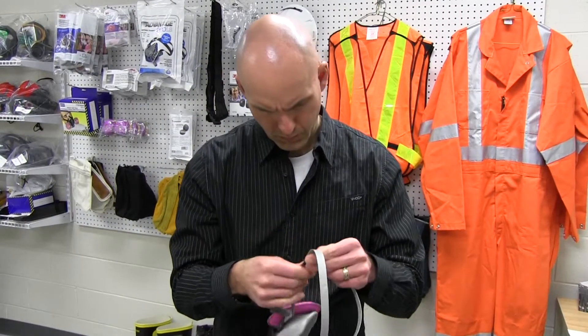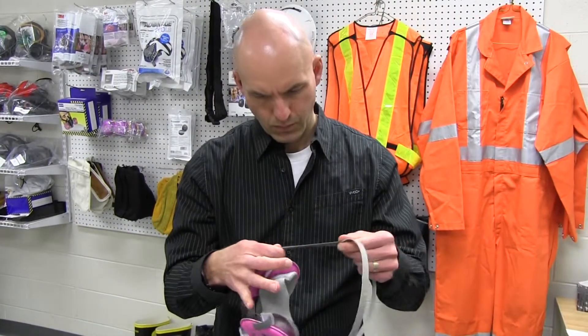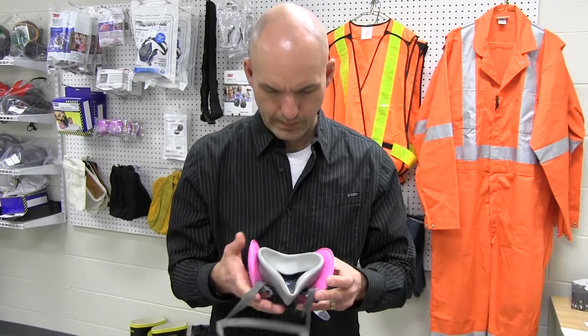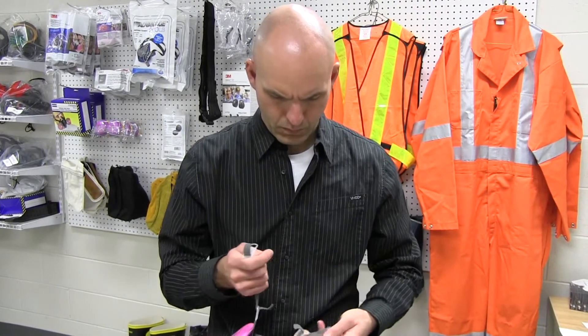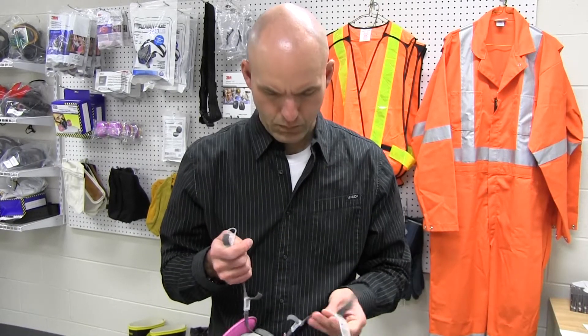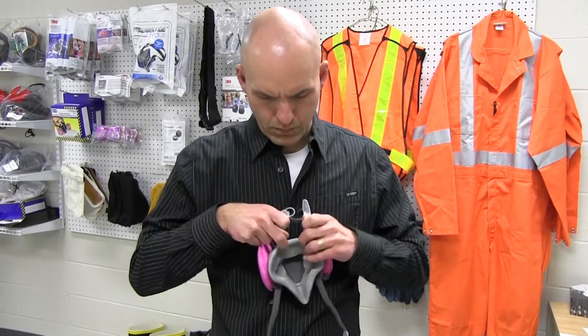Before performing a fit check, the respirator must be inspected to ensure that all the pieces are present and in good working order. For a respirator to work effectively, it must fit properly, creating a tight seal around the face.